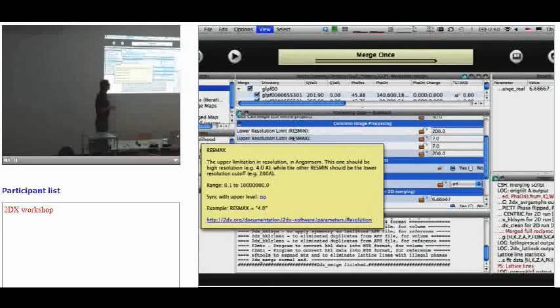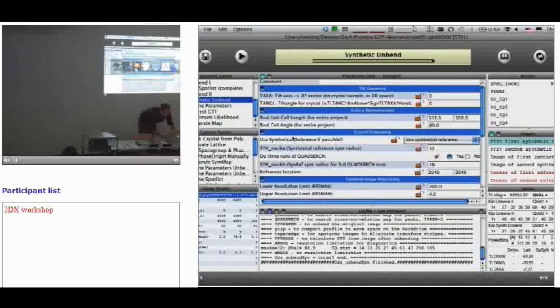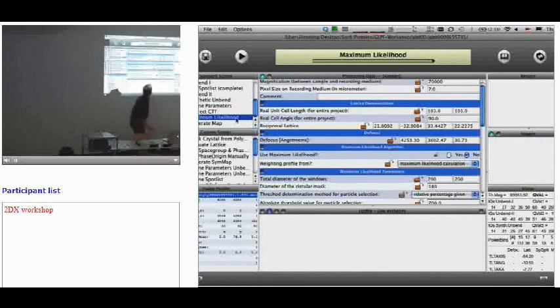I think that's it for today. Here's a maximum likelihood script, and this will use all selected images, tilted and non-tilted, for a 3D maximum likelihood run. Xiangyang is working on that. That's a prototype software here. And we have a better, more reliably working two-dimensional version of this here for non-tilted single pictures, where only the one picture that is processed with 2DX image in this program is used for the maximum likelihood run. And this runs fairly well once you have set these parameters correctly.